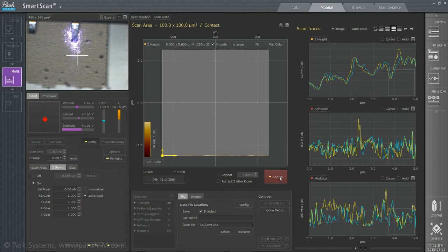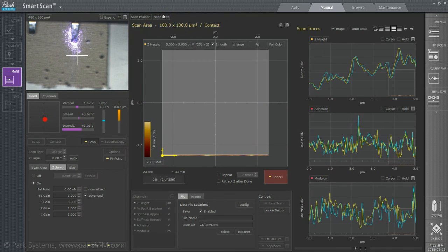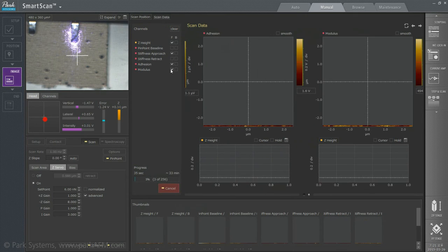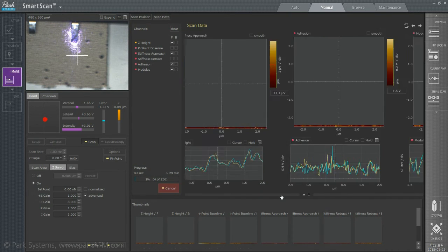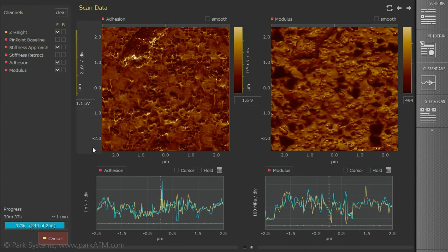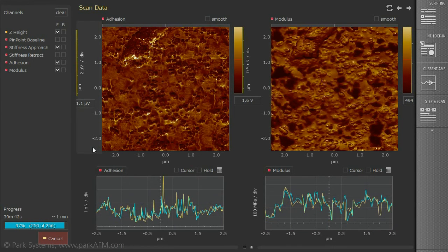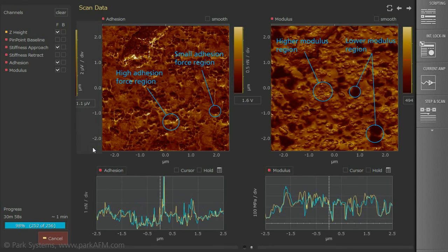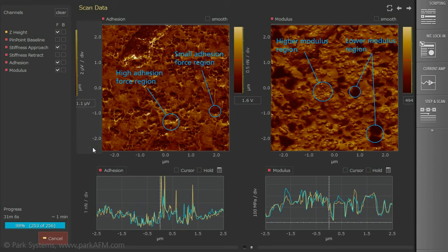To see nanomechanical calculations such as adhesion and modulus, go to Scan Data. In the Scan Data window, you can select various signal sources. These visual representations are automatically acquired in the imaging process without parameter input. Here, we can see the nanomechanical property distribution of multi-component polymer blends acquired by Pinpoint Mode. Adhesion and moduli are visualized within a 2.5 micrometer scan size. In the adhesion image, different forces are recognizable in the range of 0.5 nanonewton. In the modulus range, the contrast directly reflects the different moduli of different components of the polymer. Bright means higher modulus, while dark means lower modulus.